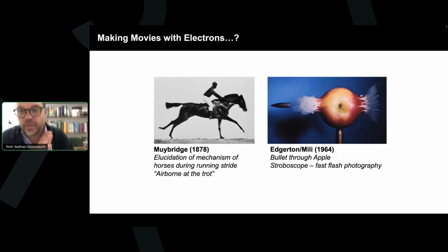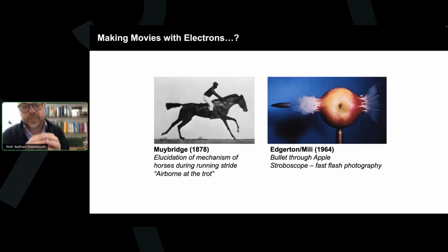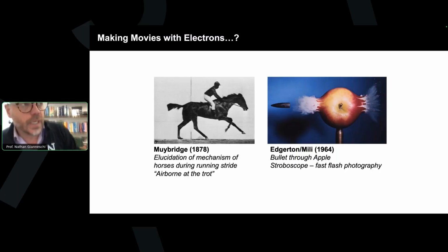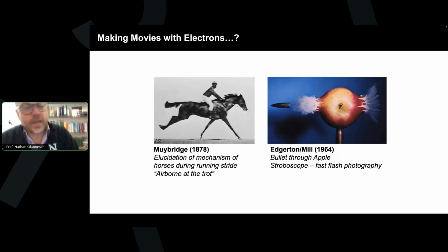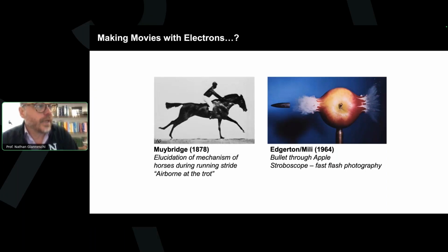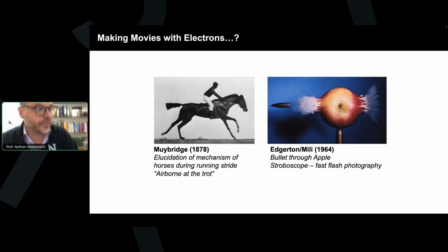It is this fascination with going from static images that have lots of information, especially detailed information in real space, and also, of course, through other kinds of methods, chemical selectivity and spectroscopy included, to the movies themselves. There's a lot of information that's lost if you look purely at static images. Of course, there are many challenges with doing this with electrons that aren't met with the analog here, which is obviously standard photography.